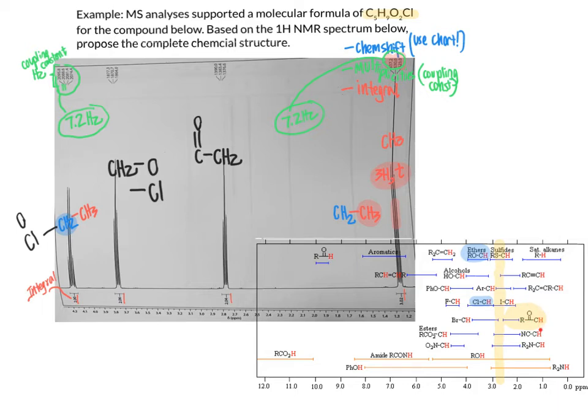So that red hydrogen in our chart is the one we're measuring, and it's separated by one bond from the carbon that's bonded to a carbonyl. So it could be something like this as a hypothetical structure. And we do have 2 oxygen atoms in our formula there, so that works out relatively well. The other thing that we need to think about here when we start plugging in double bonds or rings is the index of hydrogen deficiency, and make sure that our structure fits that.